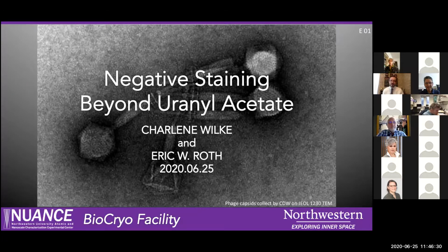Next question is, what grids or stain do you recommend for immuno-TEM? That's a good question. It depends how long you're incubating your antibodies, your primary antibody. I definitely never use copper grids. You can have an interaction there, especially if you're incubating overnight. You'll come back the next day and you'll see your droplet is green. So that's no good. For immunolabeling, I pretty much only use nickel grids.